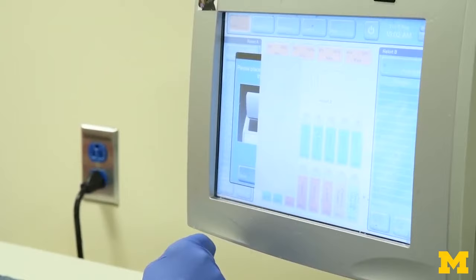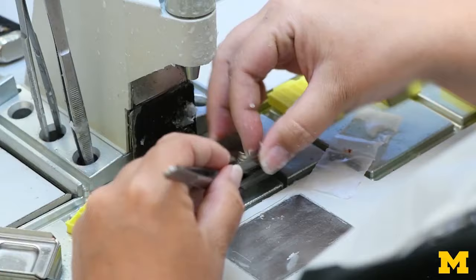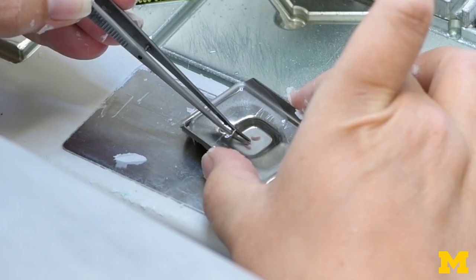After the cassettes are removed from the processor, a histotechnologist — someone who specializes in specimen processing and production of diagnostic slides — then embeds, or carefully places, the tissue into a rectangular mold that is filled with more wax in order to create what is known as a tissue block.